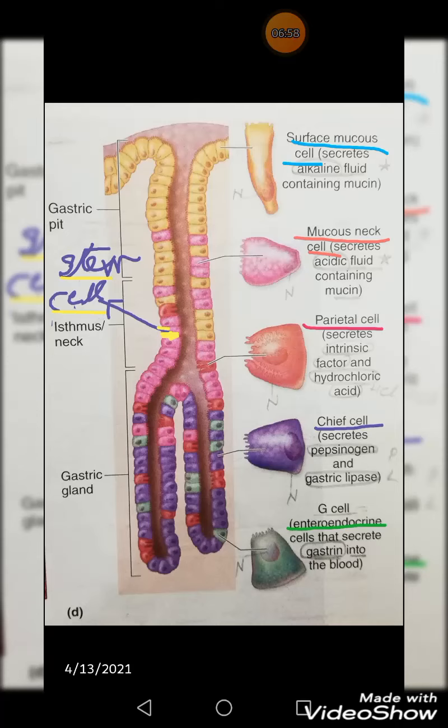And how do they look, what is their shape? They could be columnar or pyramidal, and darkly stained basophilic. Their basal part is intensely stained due to increased rough endoplasmic reticulum, but their apical part is acidophilic due to secretory granules that are zymogen that secrete pepsinogen. This is the reason they are also called zymogen cells or peptic cells.